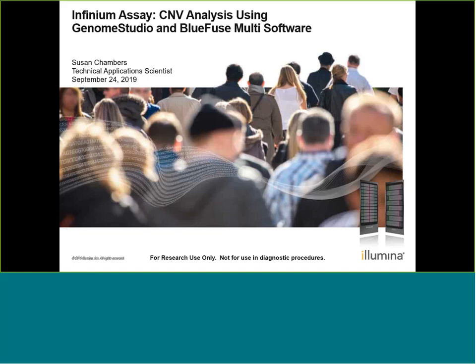So as James said, today our title is Infinium Assay, CNV Analysis using GenomeStudio and BlueFuse Multi software. And I will start our presentation today by saying that this webinar assumes that you have a working knowledge of the Infinium Assay and of using GenomeStudio. We have many resources if you are a beginner, but for the moment this webinar does assume that.